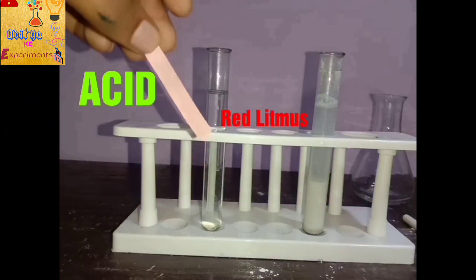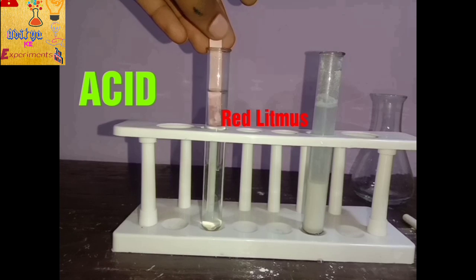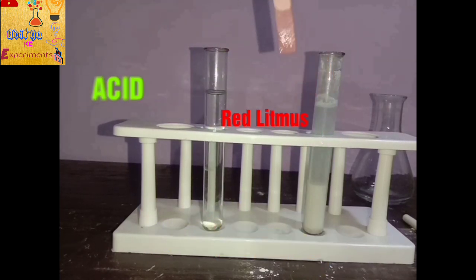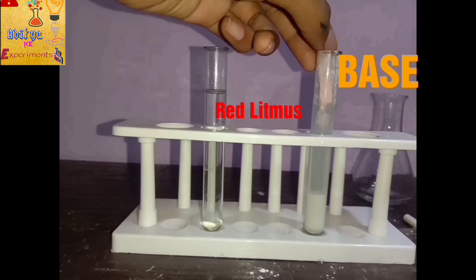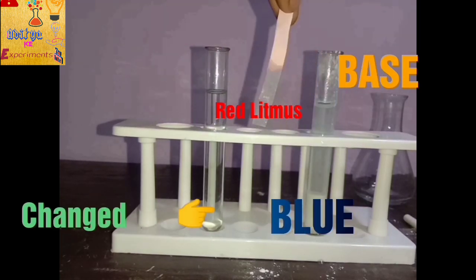Now we will check red litmus in acid. As you can see, there's no change. Now we will check red litmus in base and you will see a great change. That red litmus is changed into blue.